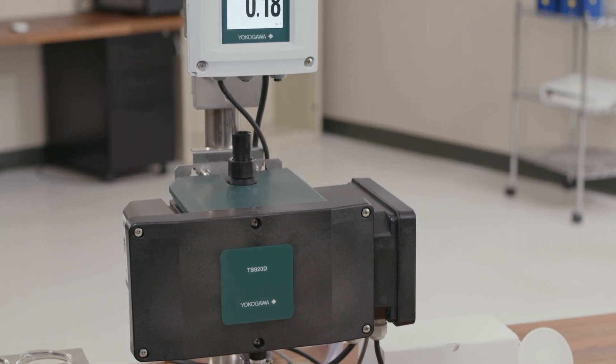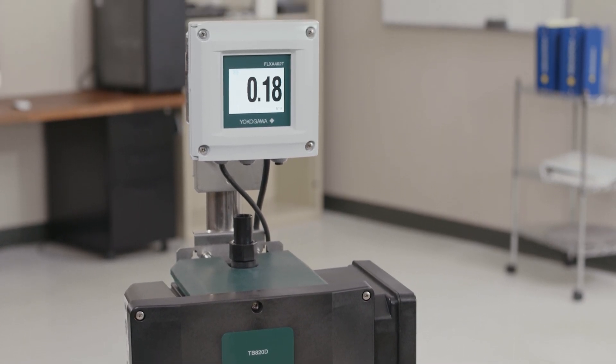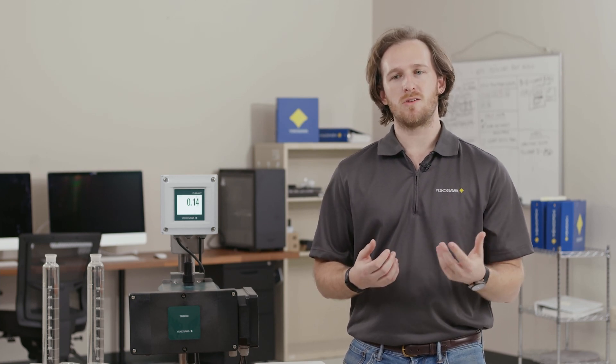First we're going to cover the zero calibration, which gives your analyzer a baseline. This gets rid of the detector noise as well as the LED noise. There are two different kinds of calibrations you can do. You have a light off calibration which is where we turn off the LED. This can be used for high NTU applications, over 40 NTU, and this just gets rid of that detector noise.